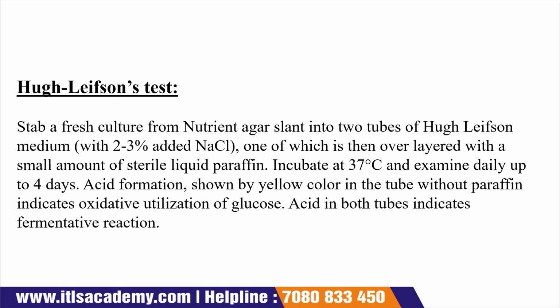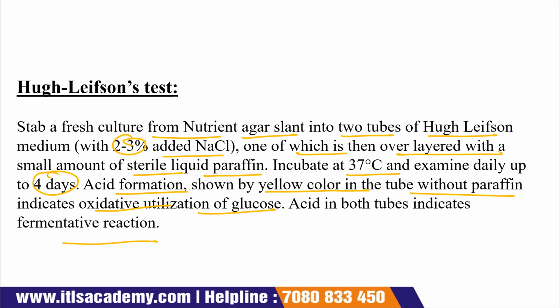Stab a fresh culture from a nutrient agar slant into 2 tubes of Hugh Leifson medium, to which we add 2 to 3% sodium chloride, one of which is then overlaid with a small amount of sterile liquid paraffin, then incubated at 37 degrees Celsius and examined up to 4 days. Acid formation shows up as a yellow color in the tube without paraffin, which indicates oxidative utilization of glucose, and acid in both tubes indicates a fermentative reaction. So this is about the confirmatory tests.